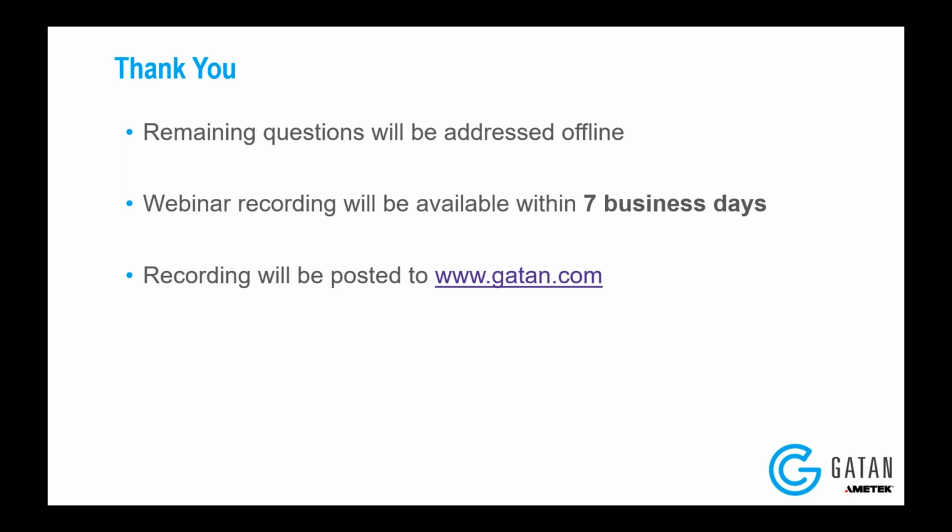Yeah, so I mentioned that the frame control lets you adjust the frame rate. When you have it enabled, the maximum frame rate that you can use is determined by the binning or the sub area readout mode that you've chosen for the camera. But the slowest frame rate you can use is 1/30th of a frame per second, at any binning and sub area readout combination.